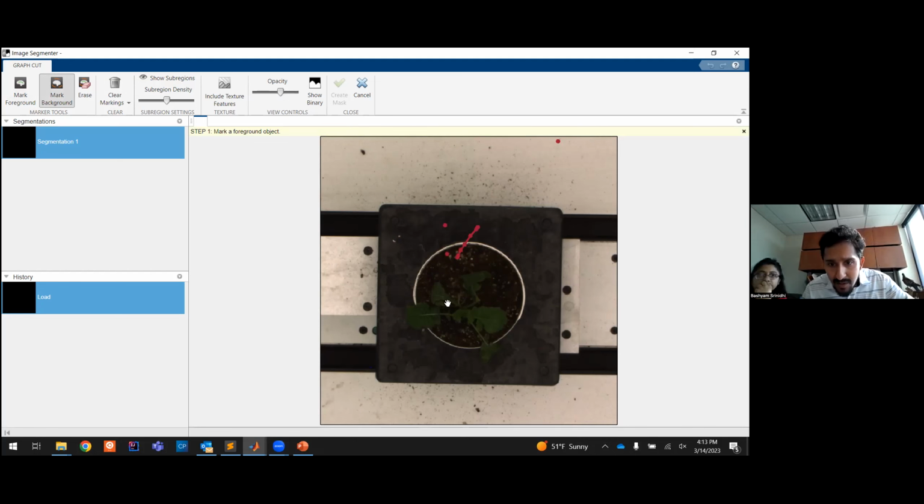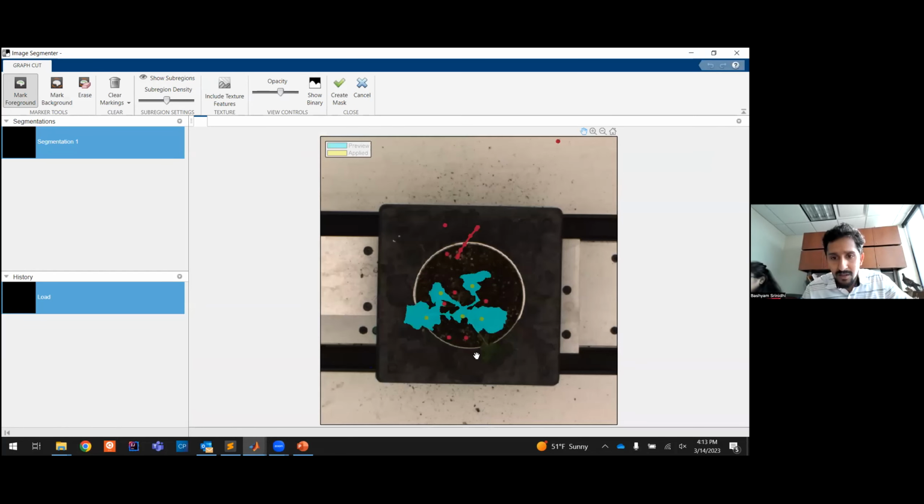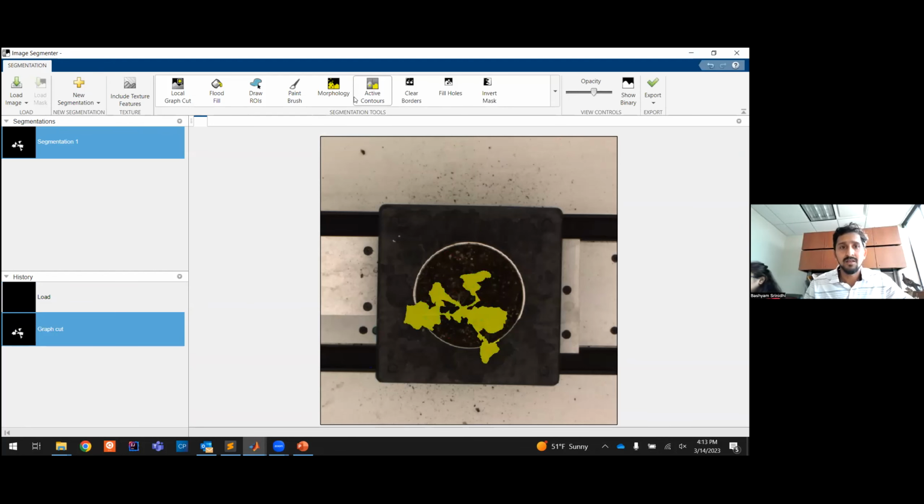I think it's fine. Sorry. And then quickly I'll do a foreground. So it's done. I can do other stuff too.